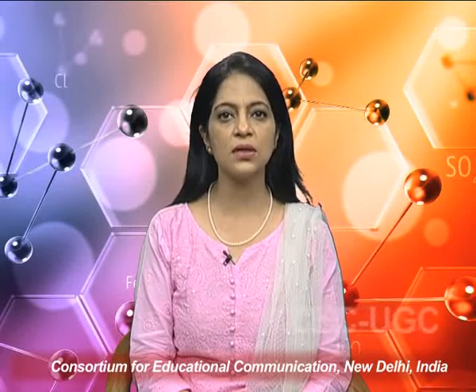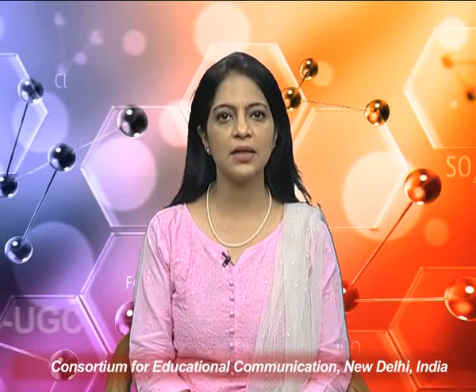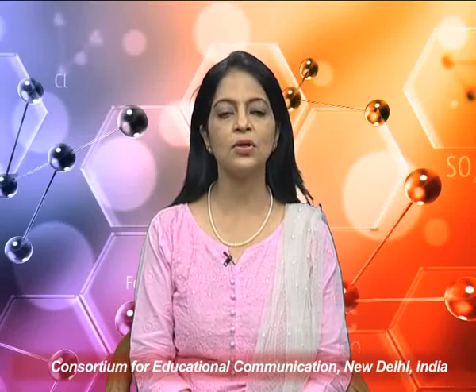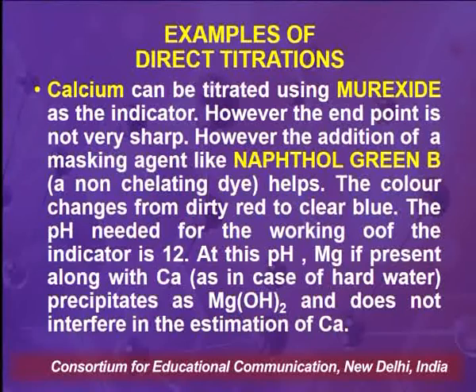So, in certain cases where aerial oxidation of the metal ion takes place, some other reagent needs to be added. Calcium can be titrated using murexide as the indicator. So, apart from eriochrome black T, calcium can also be titrated using murexide. However, the endpoint is not very sharp.